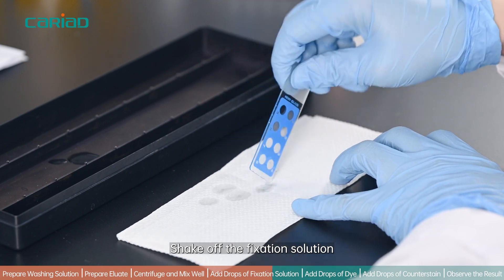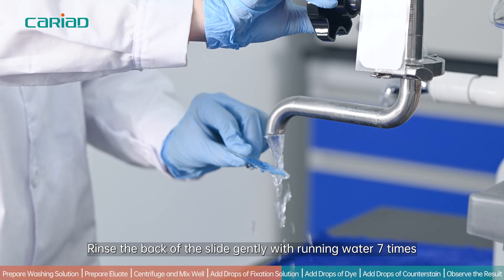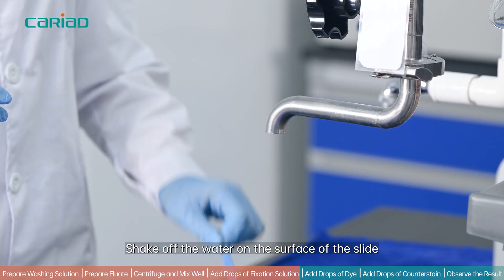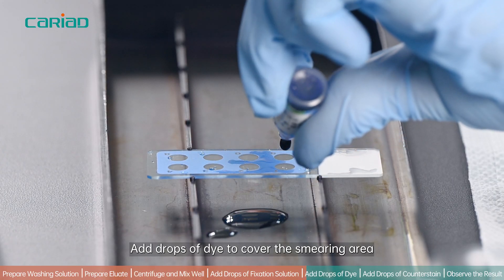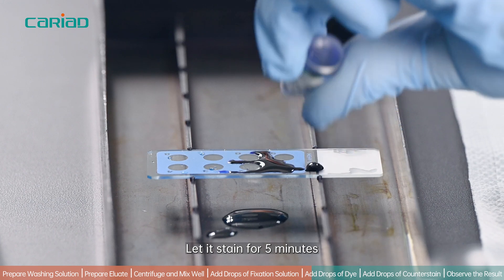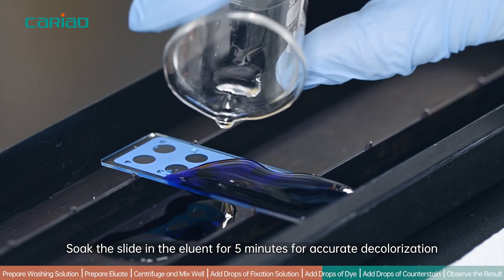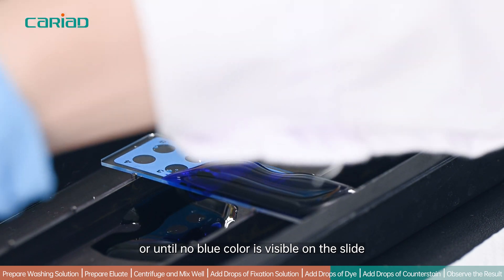Shake off the fixation solution. Rinse the back of the slide gently with running water 7 times, then shake off the water on the surface of the slide. Add drops of dye to cover the smearing area and let it stain for 5 minutes. Soak the slide in the eluent for 5 minutes for accurate decolorization, or until no blue color is visible on the slide.